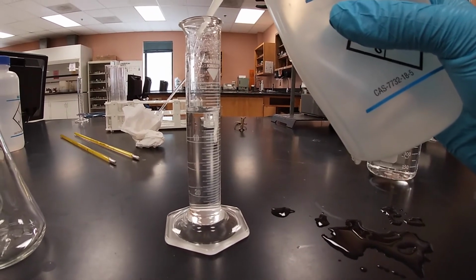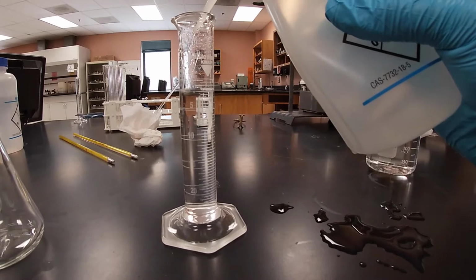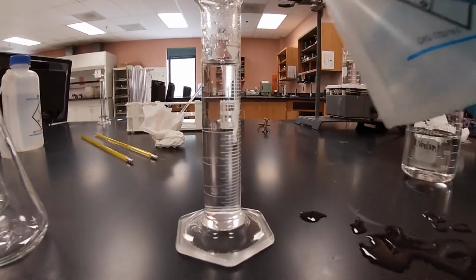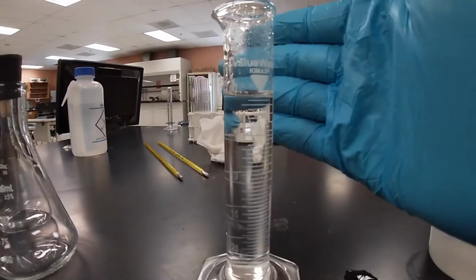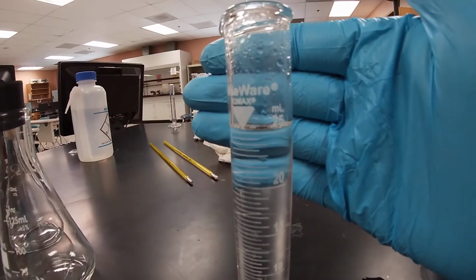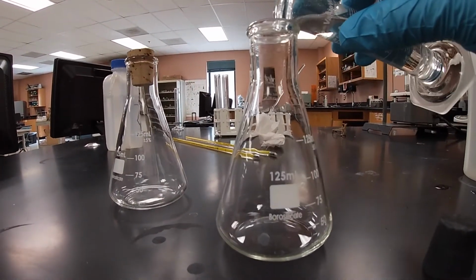And then we're going to have another type of water, which is the tap water here from the lab. And so we're going to measure the hardness of that tap water by doing the same thing. Here, we're about to measure off our 25 milliliters. And I'll have to do this again. So we got 25 milliliters. We're going to transfer onto our Erlenmeyer flask, and then we'll measure out another 25.